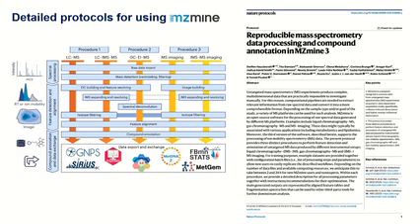Also, this year we published a protocol paper in Nature Protocols, where you can see the details and instructions for all the workflows for processing LC-MS data, GC-MS data, and imaging data in MZmine. So if you haven't seen this yet, you can take a look.